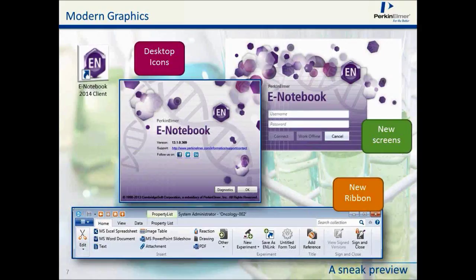Modern graphics. We have changed the old graphics of the application, and we have improved them with new screens and new desktop icons. We have a ribbon very similar to what the newest versions of Office are.